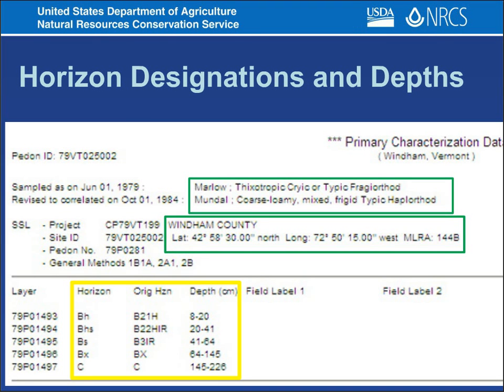And where is it going to go? This is an example of a description from the web. And notice that the information that's in the green boxes we are already doing. So we've got data mining reports that already extract the latest classifications and the original classification. And it extracts the current location. And the next step is to create reports or somehow come up with original horizon designation, current horizon designation, and standard depths post-1995.